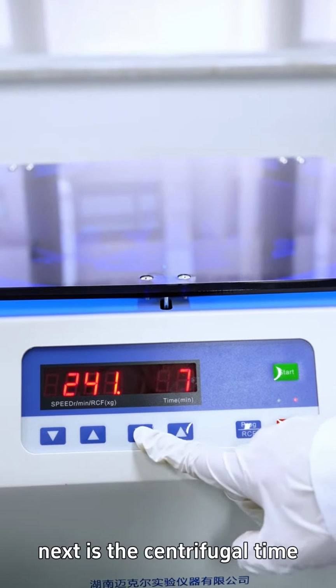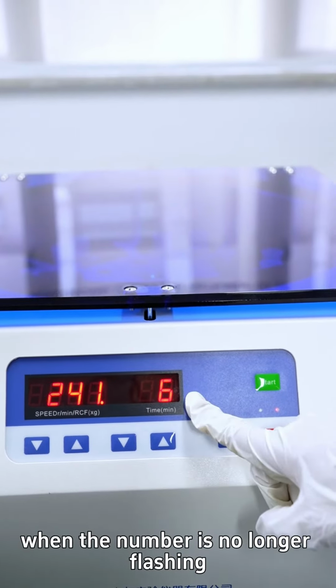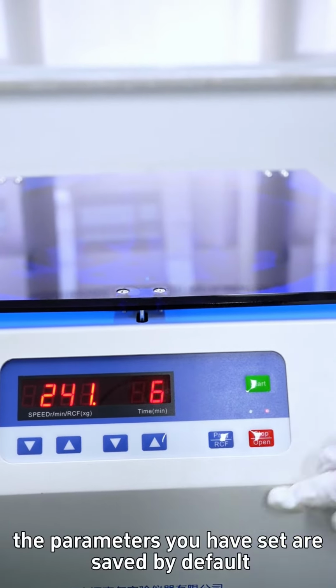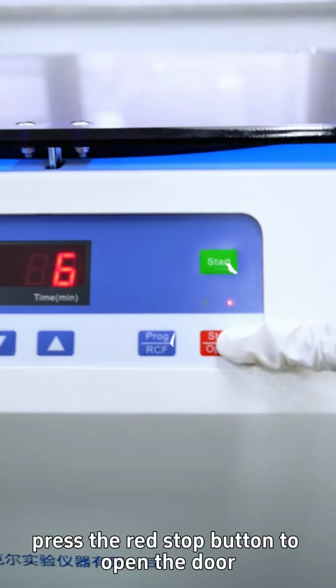Next is the centrifugal time. This is also increased and decreased by these two buttons. When the number is no longer flashing, the parameters you have set are saved by default. Then press the start button to run. Press the red stop button to open the door.